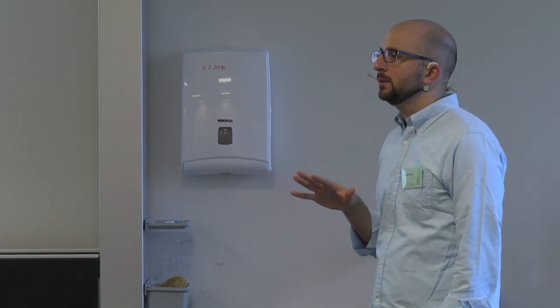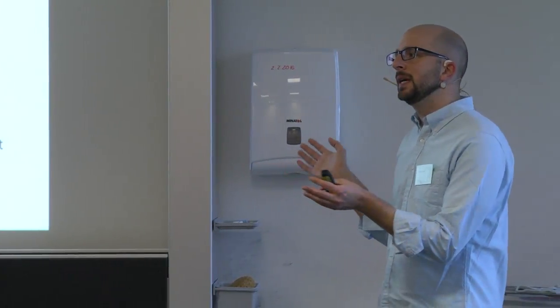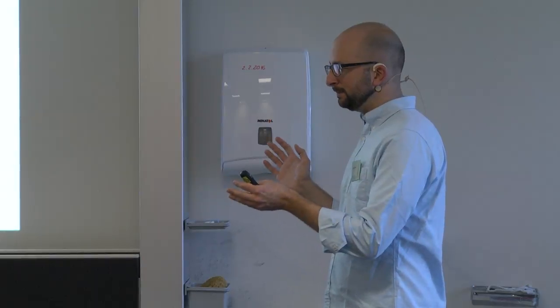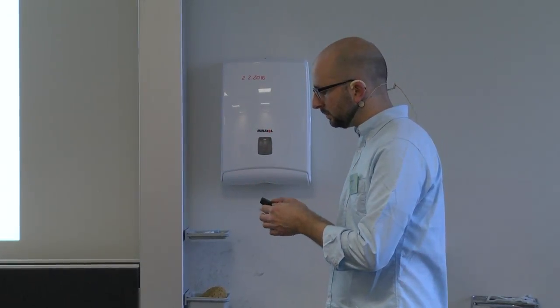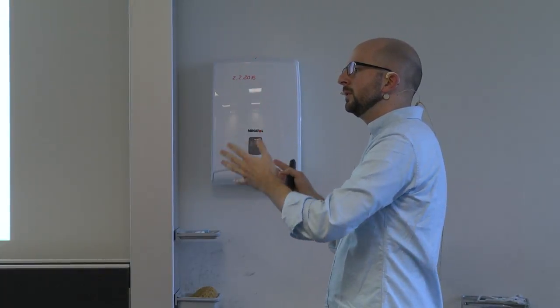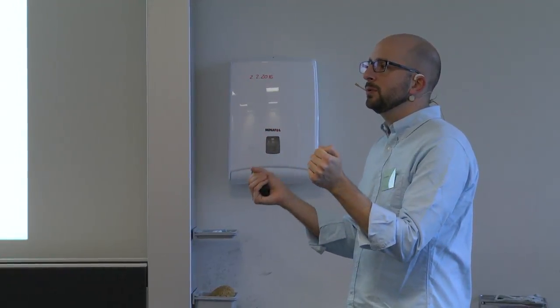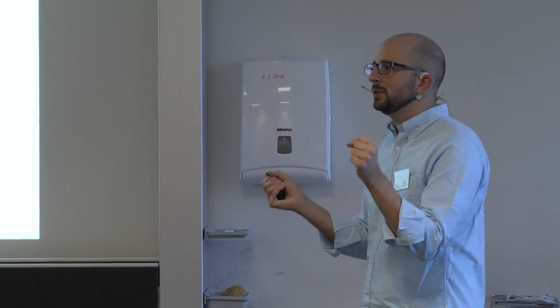If you're downloading an SRM assay, like if you try to just find some online, does it tell you which of the standard peptides were used to generate this index retention time, so that you could just apply the same ones to your machine? Specifically here they use this IRT kit from Biognosys, but once we've moved to this dimension where we don't have any units, all of them should fit into the same dimension. I've shown you now an example of endogenous peptides and the kit from Biognosys. They should fit each other. So the idea is to move into an indexed unit which is proportional, but then afterwards you should be able to always translate one to another.